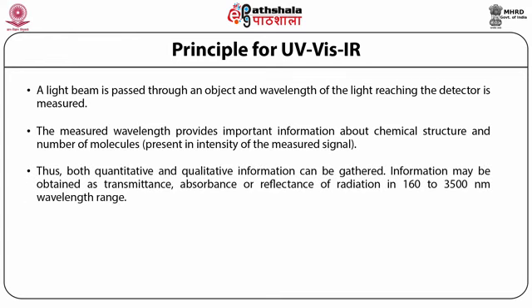Thus, both quantitative and qualitative information can be gathered. Information may be obtained as transmittance, absorbance, or reflectance of radiation in the 160 to 3500 nanometer wavelength range.